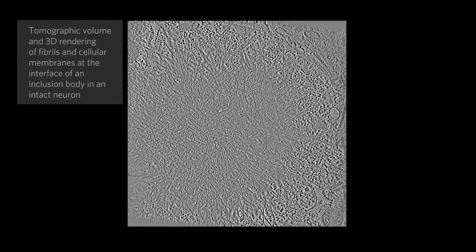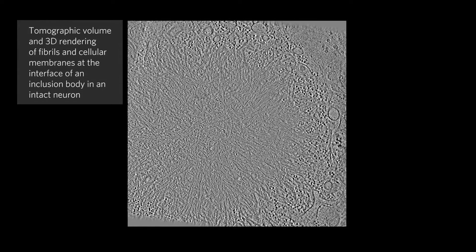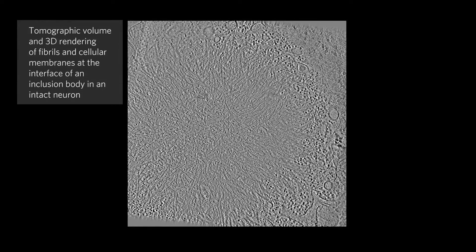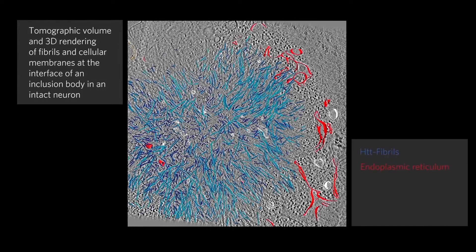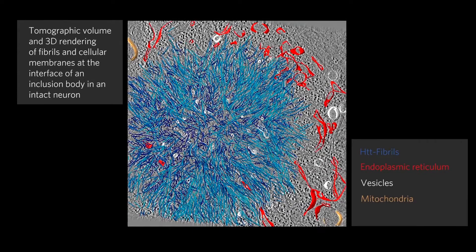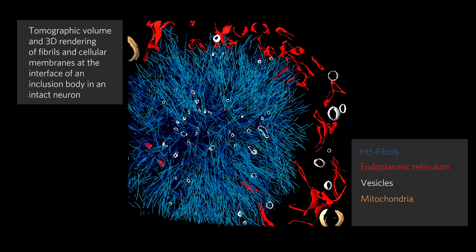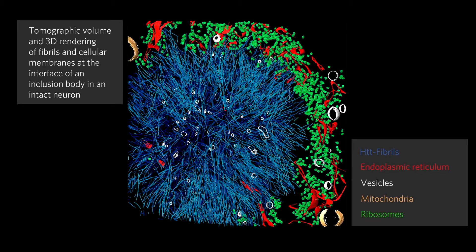In this other example, we studied a polyQ inclusion within a mouse neuron. It looks very similar to that of HeLa cells, with the polyQ fibrils in blue, surrounded by ER membranes in red, with which they interact extensively. Interestingly, large macromolecules such as ribosomes, shown in green, are excluded from the aggregate.